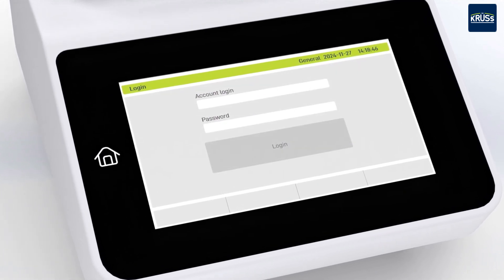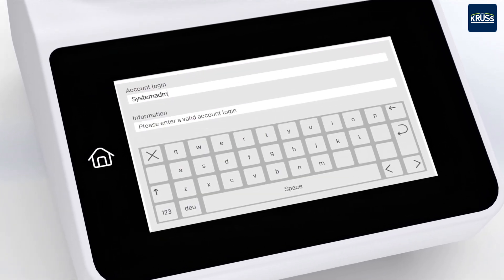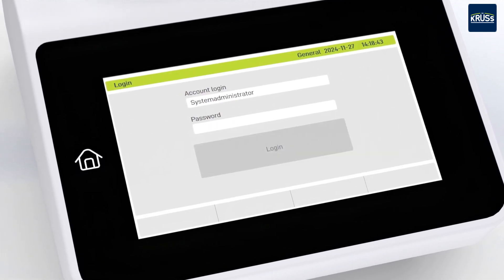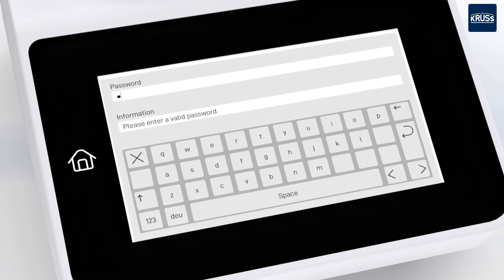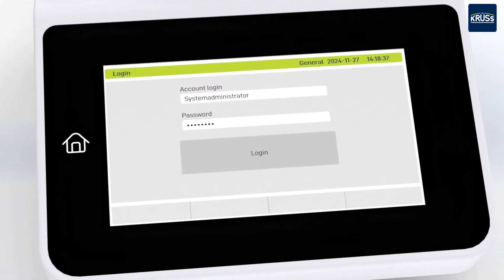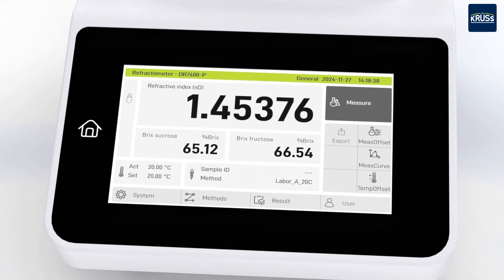The DR7000 series fulfills the requirements of 21 CFR Part 11, such as different user levels, audit trail, or tamper-proof data export. It is also well prepared for future data security and data integrity requirements.